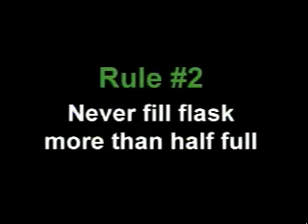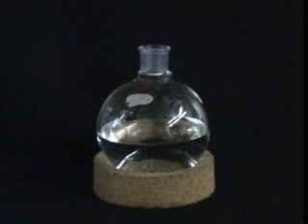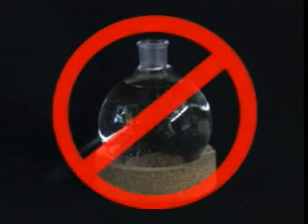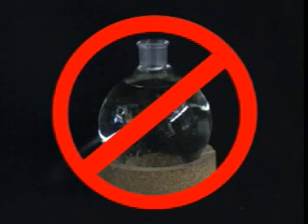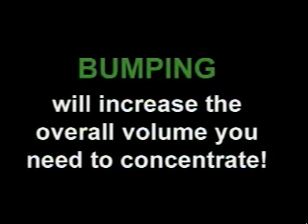Rule number two, never fill your flask more than half full. When preparing to use the Rotavap, you never want to fill your round bottom flask more than half full. Even if you have a large volume of solution to concentrate, it will never save you time to overfill the flask. It will most likely lead to an unfortunate and time-consuming problem called bumping. In other words, your material will take a trip to the bump trap. This will require you to rinse the bump trap with solvent, adding even more to the overall volume you need to concentrate.